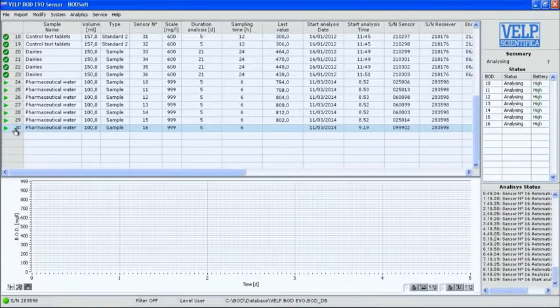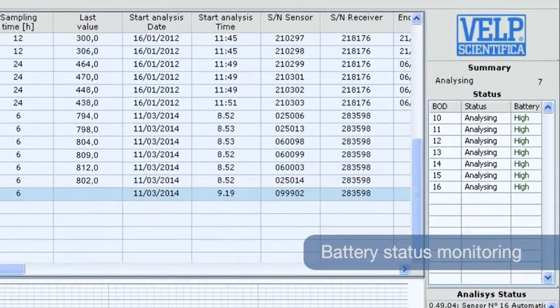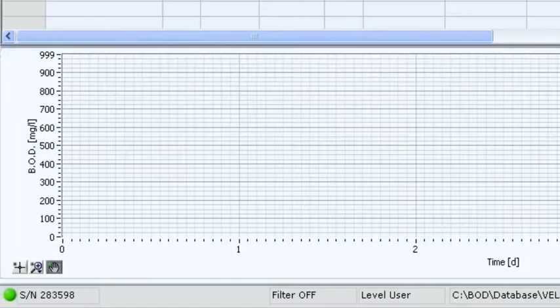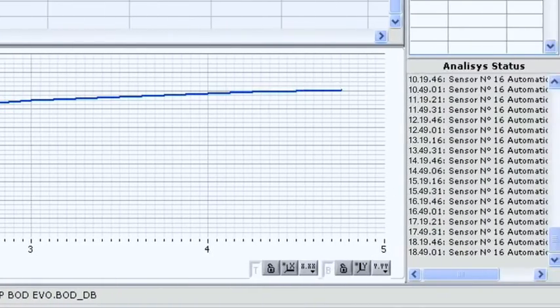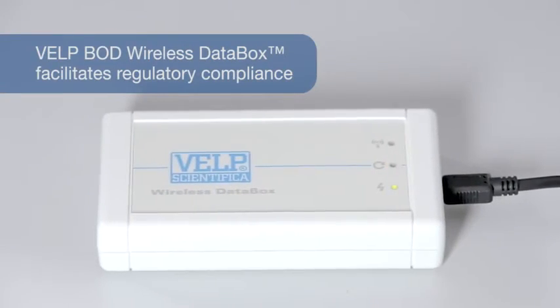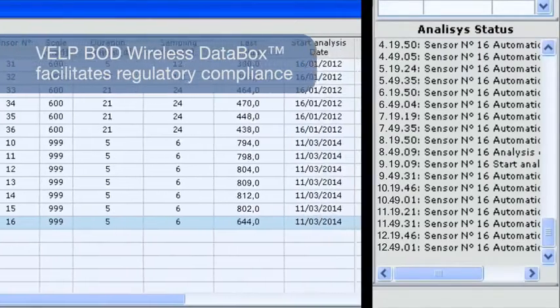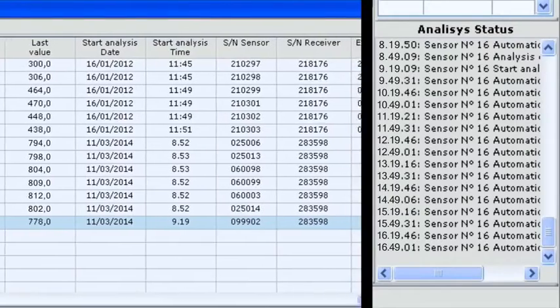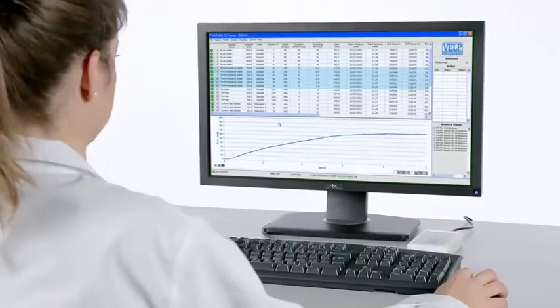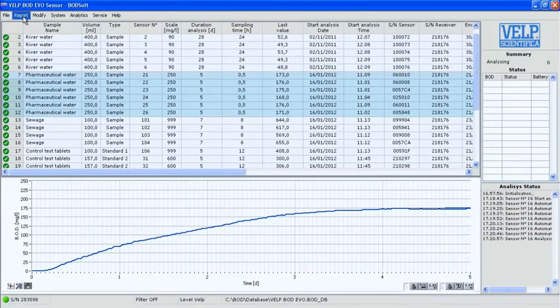All the most important info are constantly shown, including the status of the sensor's batteries and a database with automatic real-time graph creation. The exclusive wireless data box facilitates regulatory compliance, continuously monitoring and reporting parameters shown through BODSoft when connected to a PC. Once the analysis is completed, all the results are stored in the database.